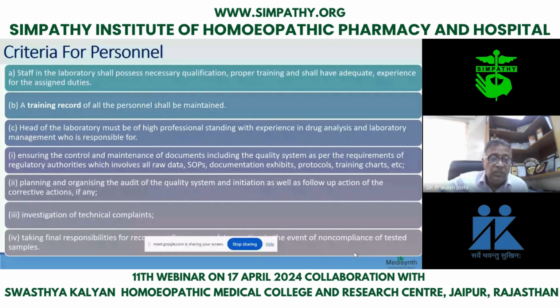Example, I will tell you, the alcohol. The alcohol which we get, you must be knowing that now most of the companies write ENA, extra neutral alcohol. ENA is nothing but the same alcohol, but free from aldehydes, ketones, and fusel oil. These three impurities create a problem.